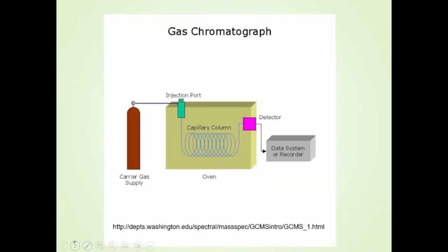All right, so let's talk about gas chromatography. This should be fairly familiar. You did a few of these in Organic 1. Basically, we have a sample that was injected into an injection port. This is kept very hot, so it immediately vaporized. We're constantly blowing a carrier gas through. For the GCMS, we're using helium, and it goes through the capillary column, and the peaks separate.